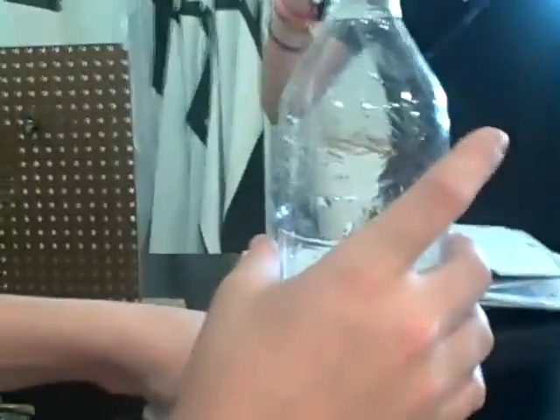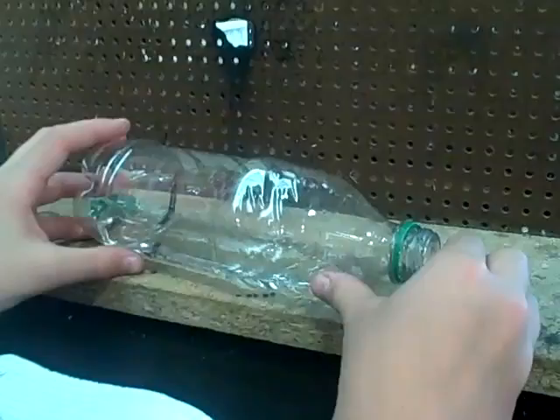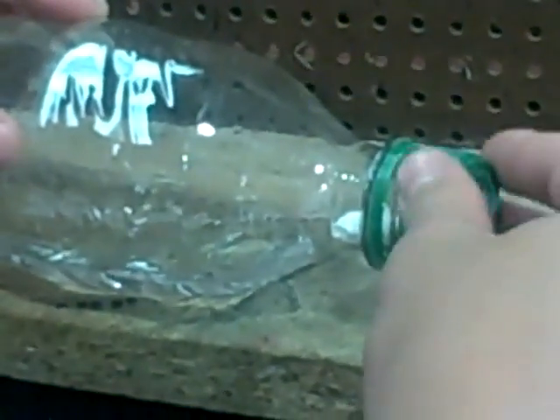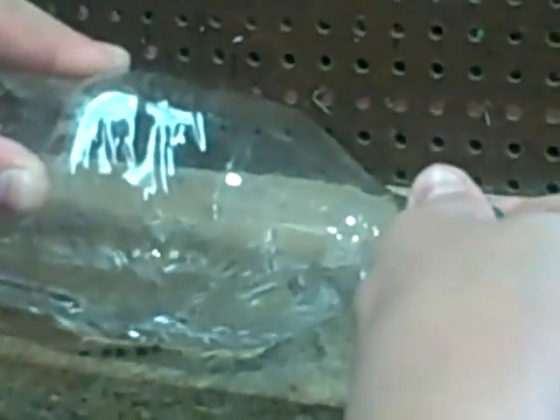Now we're going to take it out and take the cap off. Make sure the water doesn't come out because you might have too much water. So we're going to put the Alka-Seltzer in. Now our Alka-Seltzer is sitting at the top of the bottle so that the water doesn't touch it and mess up our data. Then you put it closed once it's fully ready.